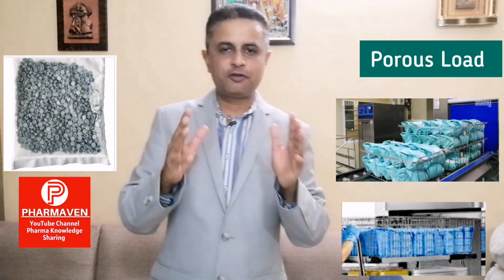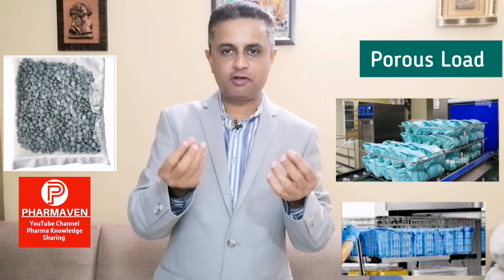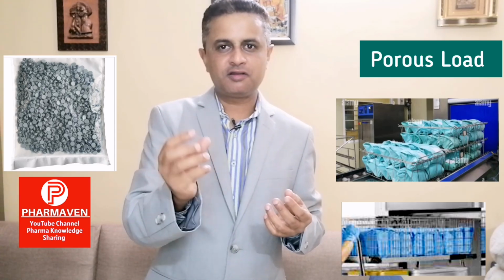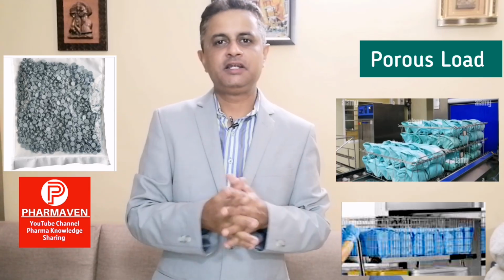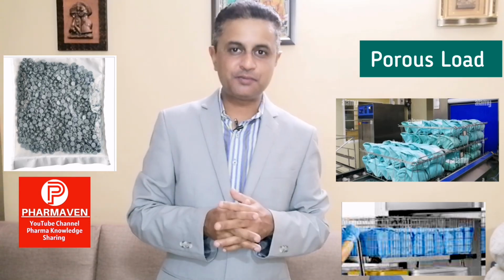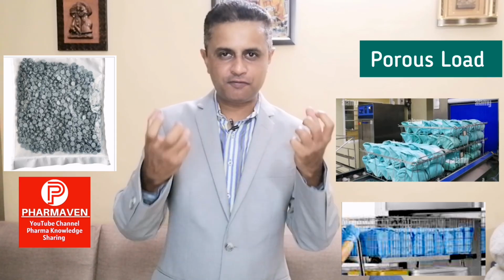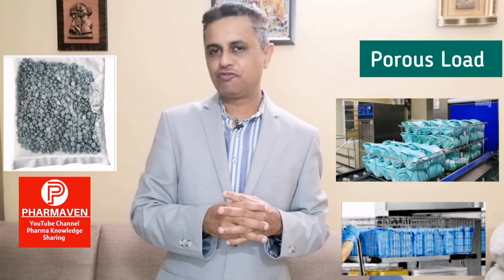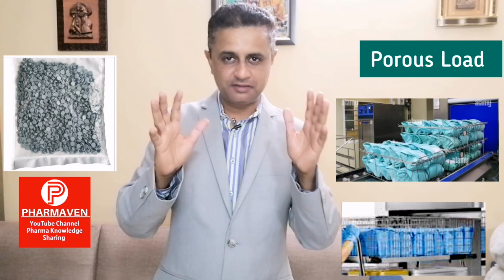I'll repeat. Loads such as rubber stoppers, garments, seals, or loads where we are putting a lot of small flexible items like gaskets, like small plastic items inside a bag within a load, will be called a porous load. Why do we need to differentiate this as a porous load? When we talk about a porous load, it has a lot of small things, a lot of cavities, air pockets, and that makes air removal difficult when we are going for sterilization. So that's why this differentiation is necessary.